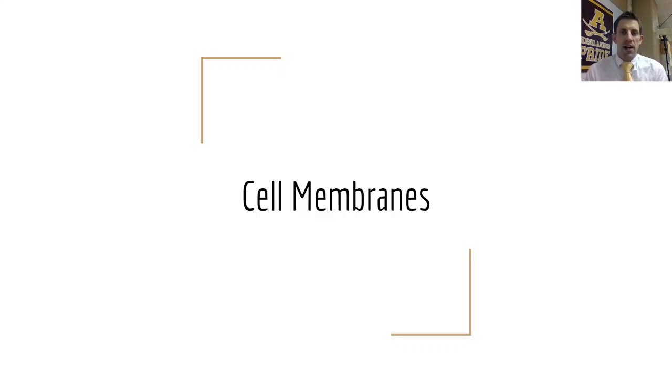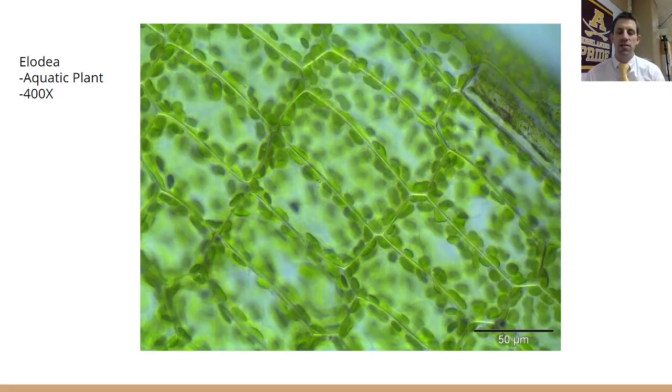Mr. Bondi here with our next biology lesson, this time on cell membranes and on cell transport. In this image here, you can see Elodea. It's an aquatic plant, and we're looking at it magnified 400 times, so under high power of our microscopes.